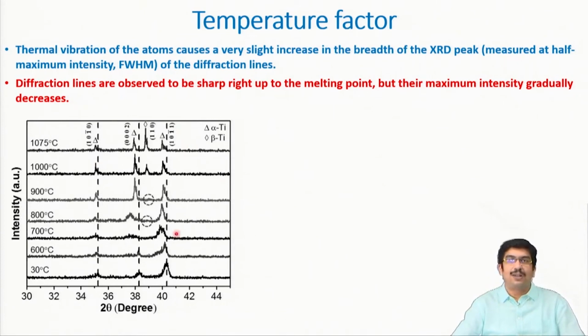So, you can see this is one such experiment done on two different titanium alloys. And here you can see at room temperature, this is one. So, this is a phase transformation. This is a classic case of phase transformation, which I was discussing in the last module, gamma to alpha. If you remember how the austenite and ferrite phase transformation happens and how different peaks evolve, from which we can identify this transformation. So, here also you can see that same thing, that as we increase the temperature, we are getting a completely different peak altogether, that comes out at a certain temperature, 1000 degrees onward, which is not there in this low temperature X-ray diffraction profile.